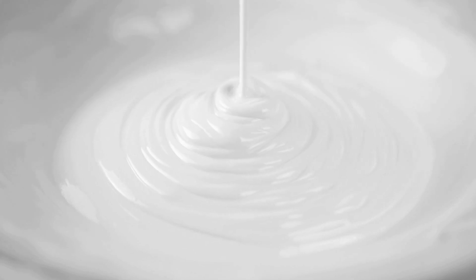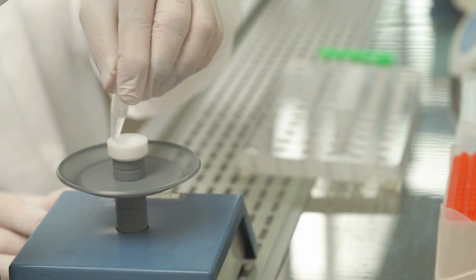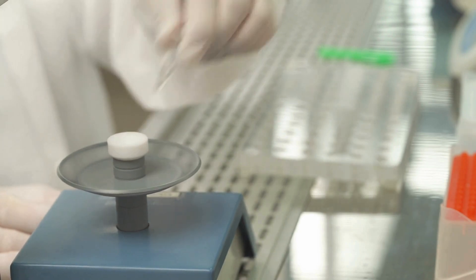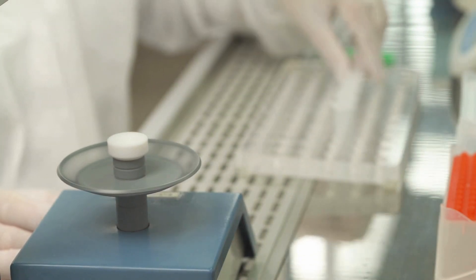Reason five. It's affordable now. Lab gear used to cost a fortune, but today's digital stirrers are surprisingly affordable. Real-life demo.